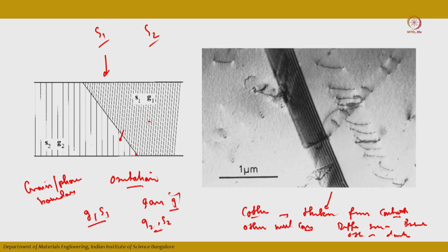So, here there is an image of a grain boundary, and you can see these fringes which look like thickness fringes. This is due to the tilt of the grain boundary which is present, differentiating the two oriented grains. Okay.